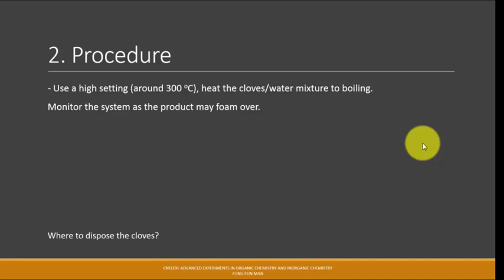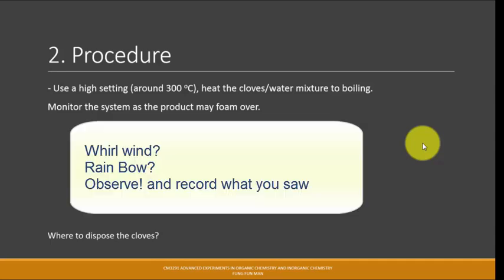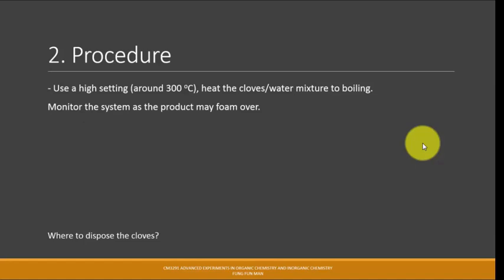You see that it stirs, right? Like a whirlwind, and then the color changes a bit, and then you see bubbles coming out. You get some kind of emulsion here and there. I shan't tell you more. You can experience it yourself, record down all these observations, right?